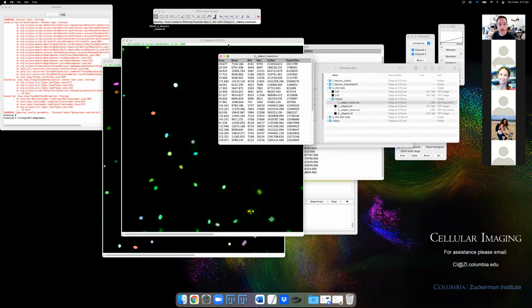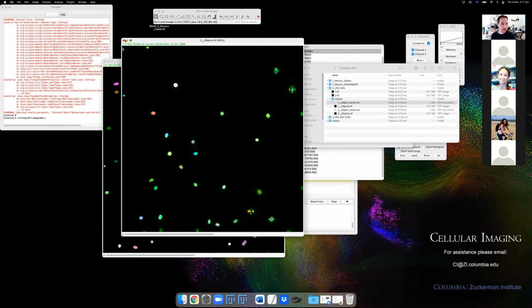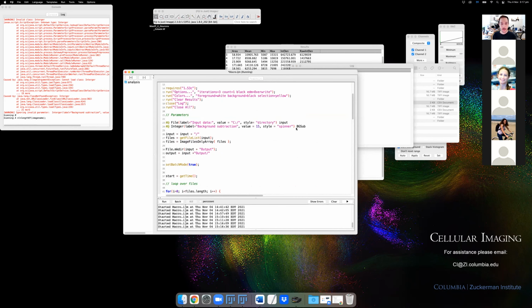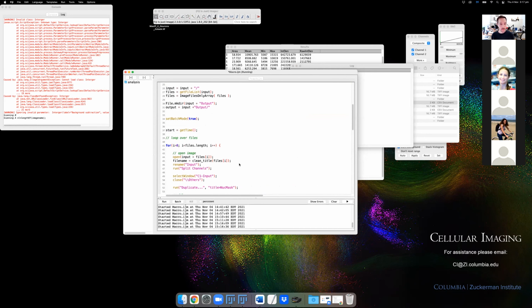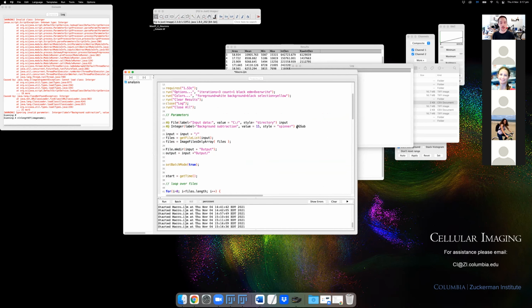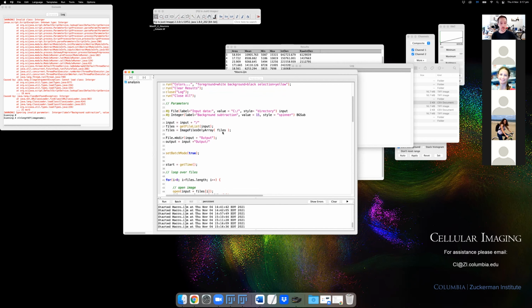Our counts now should be a little bit better. I think this is a shorter list, so we're really just getting the counts for each image. Just to make sure this is working properly, oh okay, the reason it's not working here is we're setting this 15 as BG subtract, but down here we left it as 20. To fix this, we need to put in some quotations here, 2 pluses, so it's going to use that variable, and then we can just paste the variable. So now whatever we type in for this GUI, it will use.